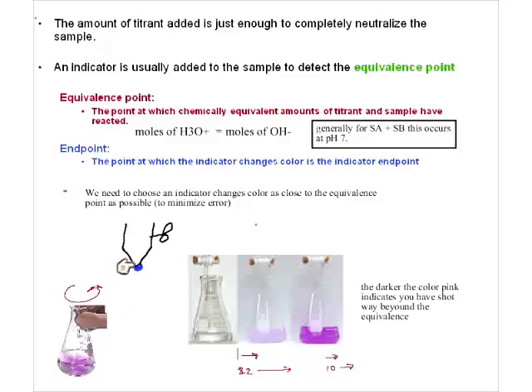So what's going to happen is as the sodium hydroxide drops in, this is going to cause the phenolphthalein to start turning pink. And as you swirl it, of course, the pink fades because we're mixing it up nice and even. But as the pH begins to rise, now at 8.2, we've already gone past the equivalence point. Because remember, for a strong acid and a strong base, the equivalence happened at 7. But changing at 8.2, if we stop when it's very, very light pink, then we're closer to pH 8.2.